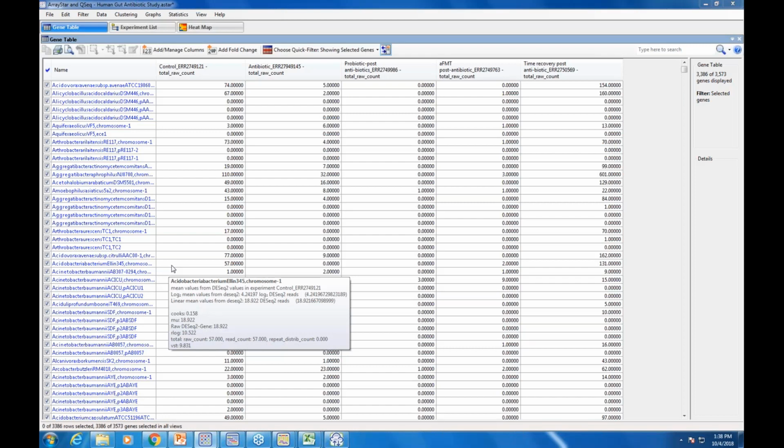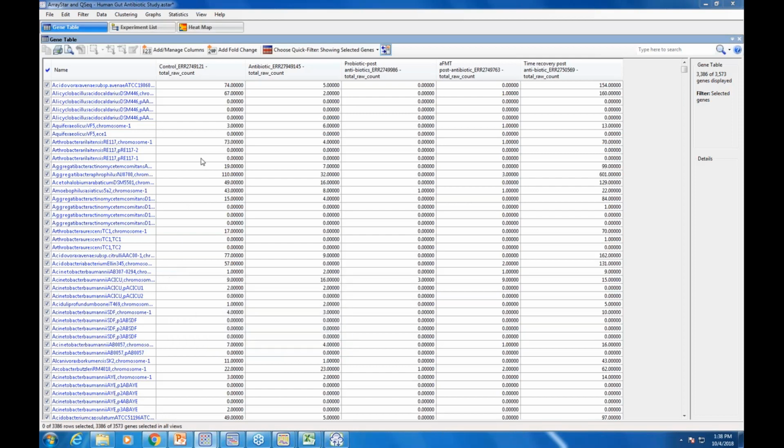Now I only grabbed a few samples from a huge clinical trial. So I know that there's a lot of sample-to-sample variation depending on the individual that's involved. Everyone's got different populations in their gut. So the best way to do this would have been to have everything here. But for today's demo, it would have been a little bit too much.